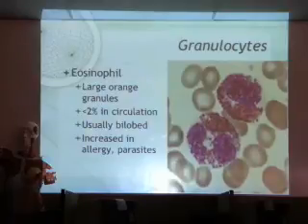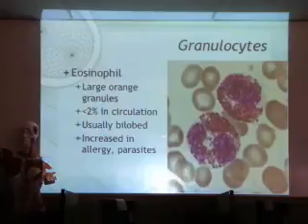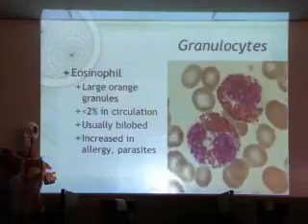They'll all have irregular looking nuclei. In the case of the eosinophil, it's a single nucleus, but it's separated into 2 lobes, connected by a little thin filament, which is a fused nuclear membrane. So you have 2 lobes connected by a filament. Eosinophils are characterized by the presence of orange-brown large granules in the cytoplasm. These granules are about 2 microns in diameter, generally uniform in appearance and size, so that's why I like to call them orange jelly beans.